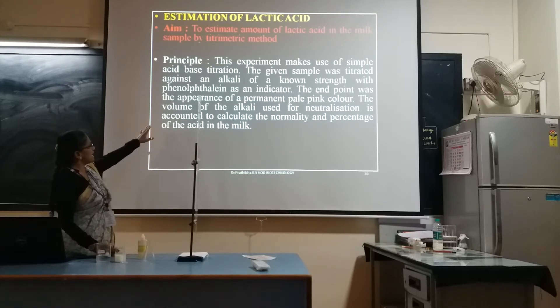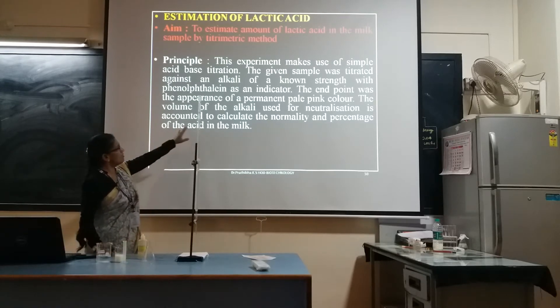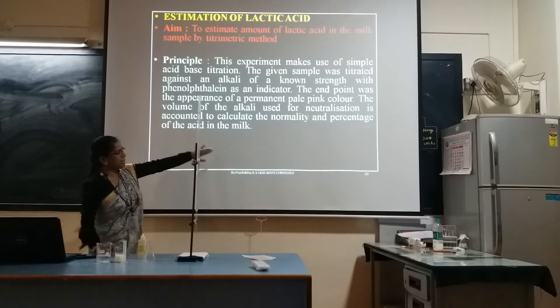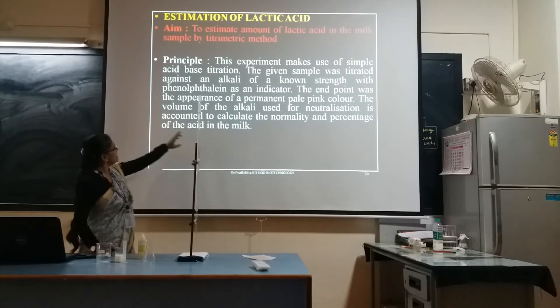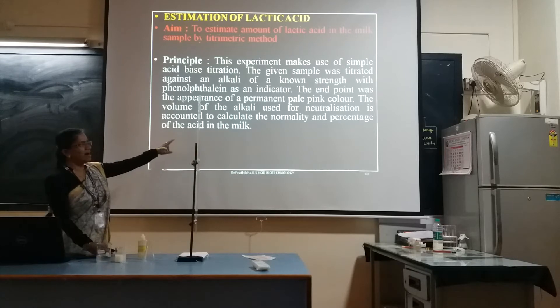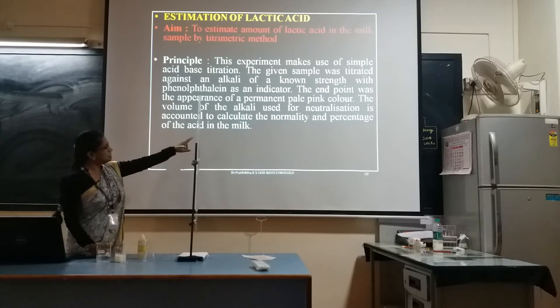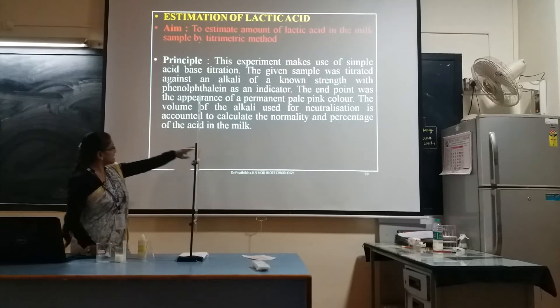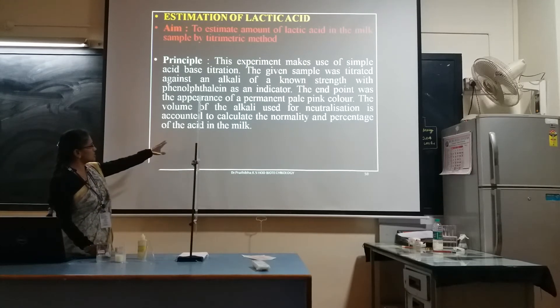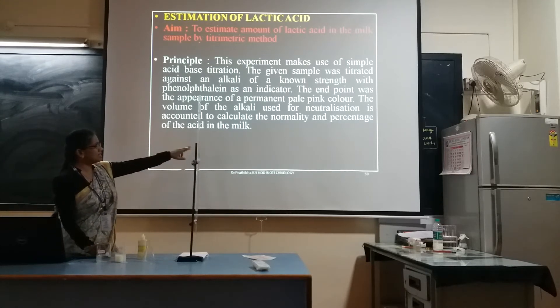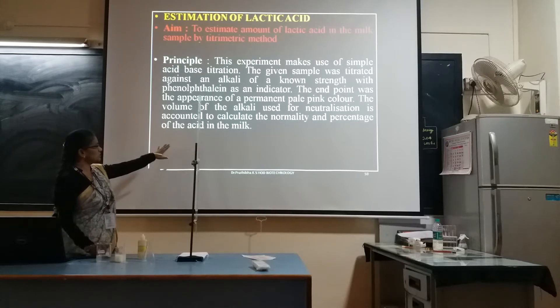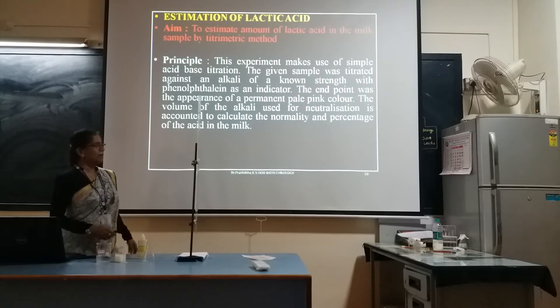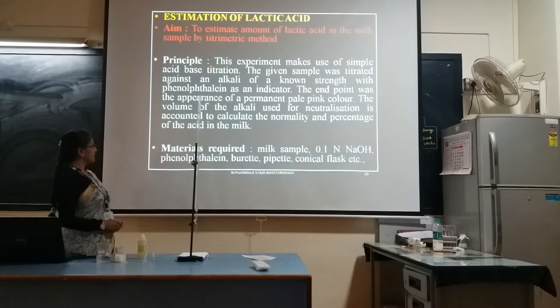The end point was the appearance of a permanent pale pink colour. The volume of alkali used for neutralization is used to calculate the normality and percentage of acid in the milk sample.